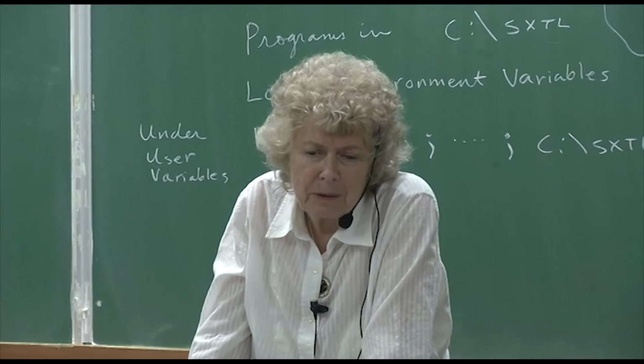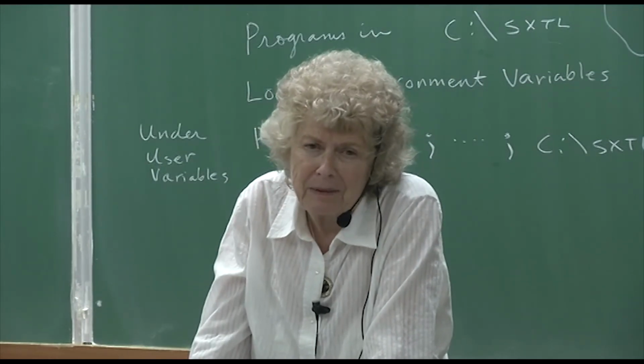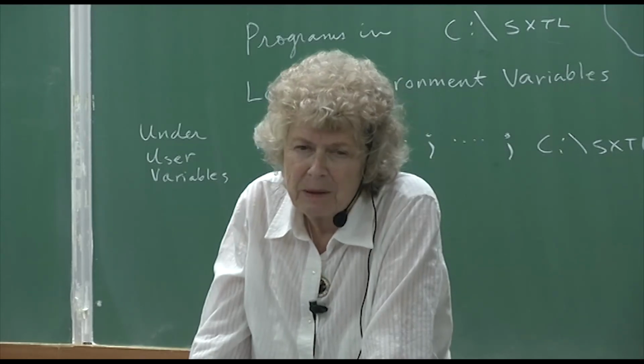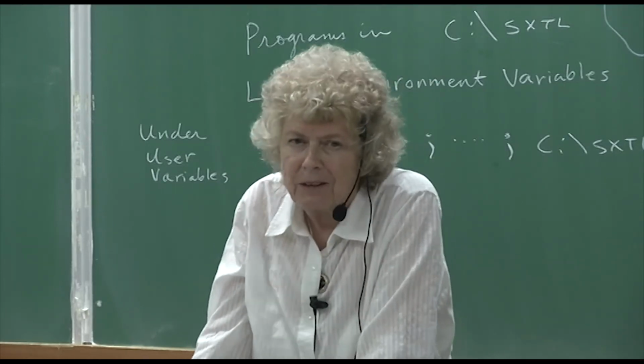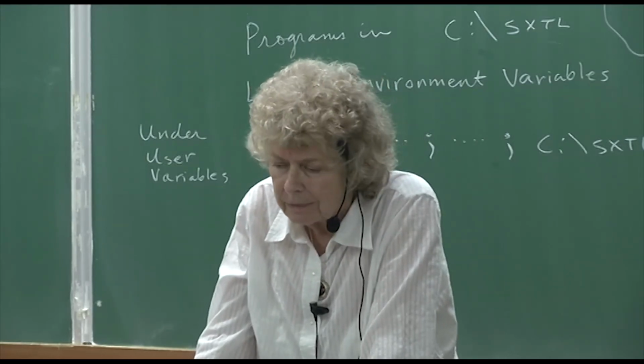What else can you do except to make it isotropic? But that's going to really raise your R value if it's a heavy metal. Something with a lot of electrons is really dominating your scattering and really is the main thing affecting the R value.